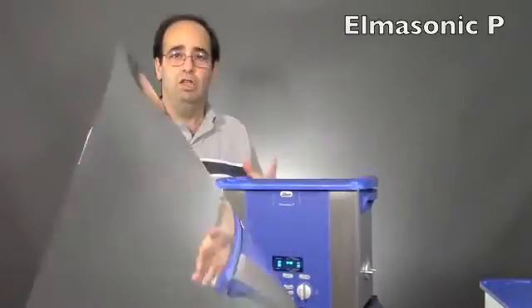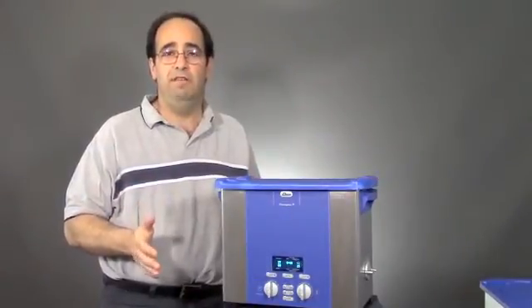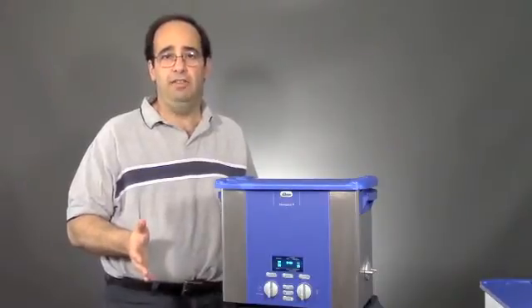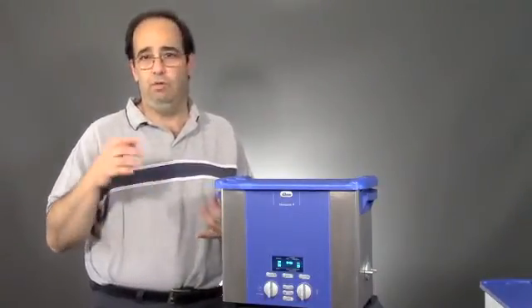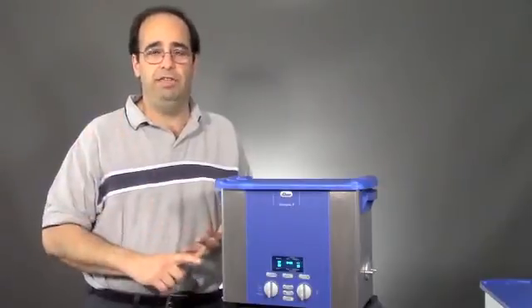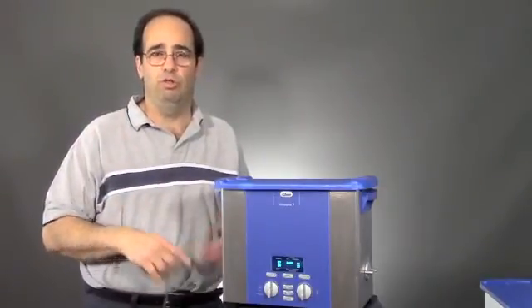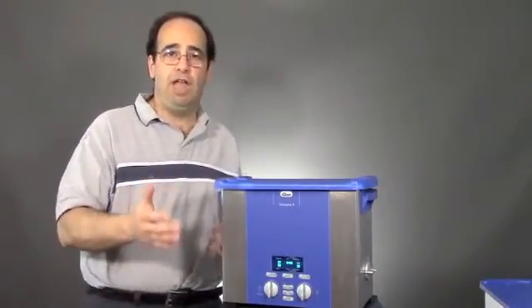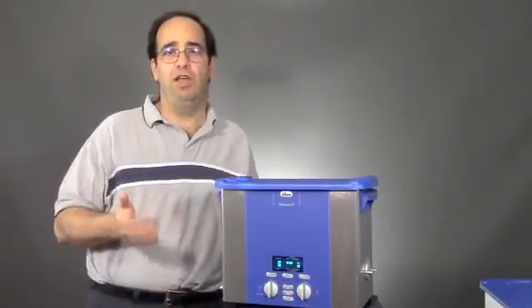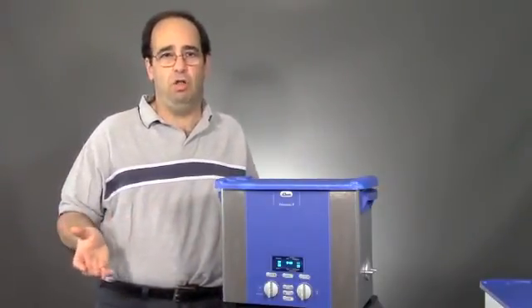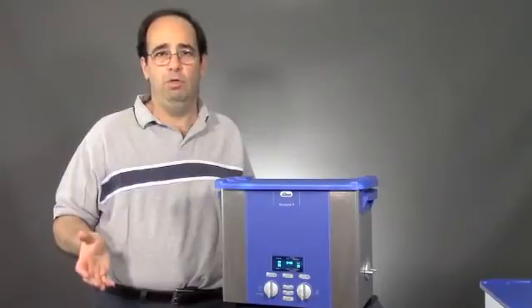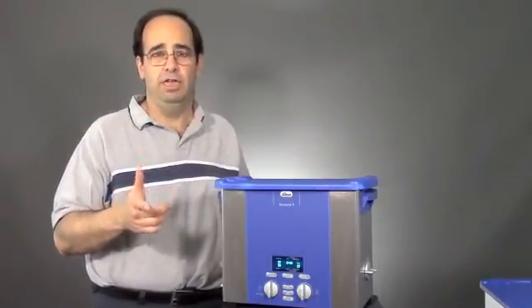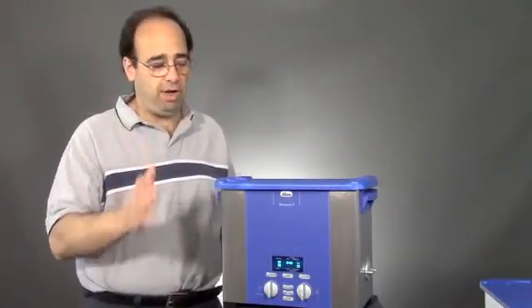These are the Elma Benchtops. If you're interested in any of the details, just contact us. We'll give you spec sheets, operation manuals, sales brochures, whatever you need. If you're not sure which line is right for your application, give us a call. We've seen it all. We know what we're doing, and we'll give you a straight answer. Hope to hear from you soon. Have a great day.